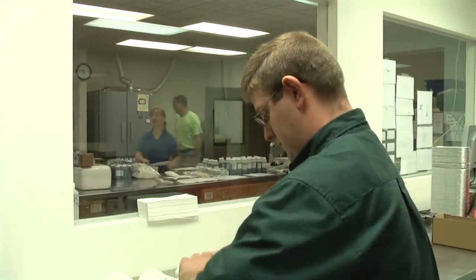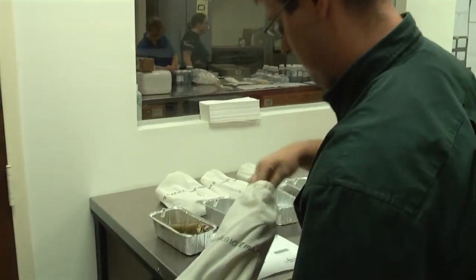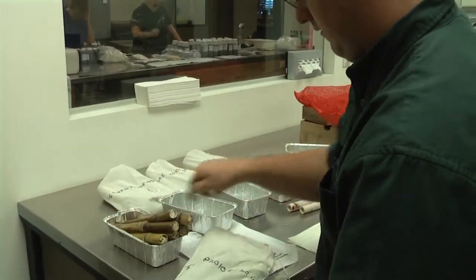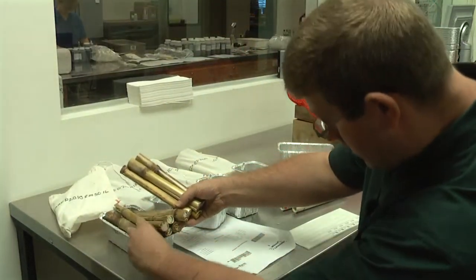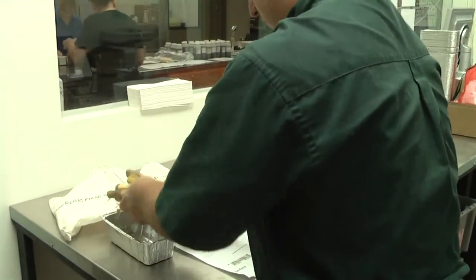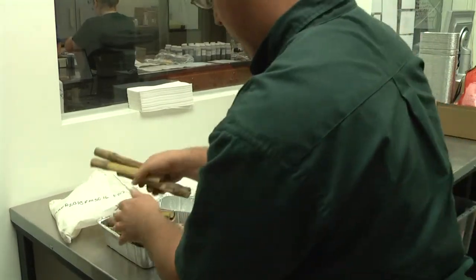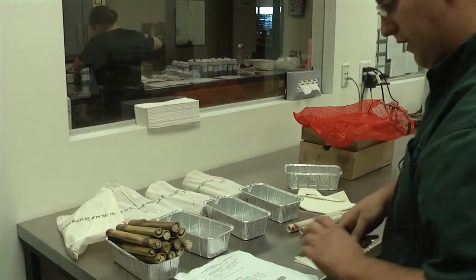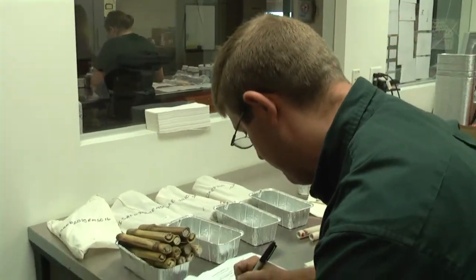Now that the paperwork matches the bags, we're going to take the samples out and count to make sure there are ten samples per bag. This particular sample happens to have twelve samples in it, so we're going to note that sample one has twelve samples.